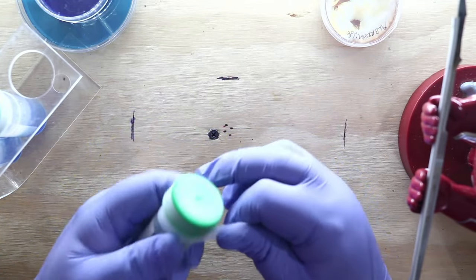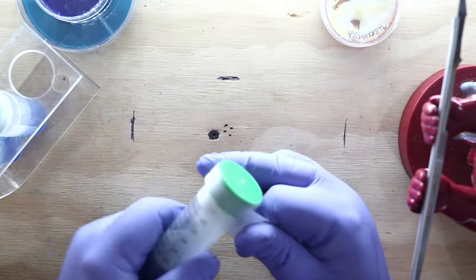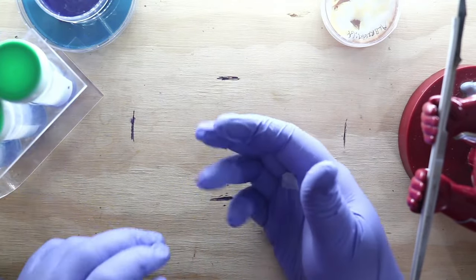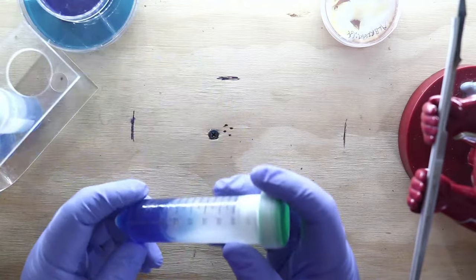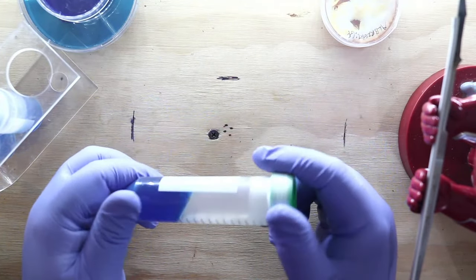But you have put toothpicks and things in previously, I've seen. I have. And I do that if I'm doing no pour, I'll sometimes put wood in it because it's easier. But when I make these slants, they are all poured using a peristaltic pump.